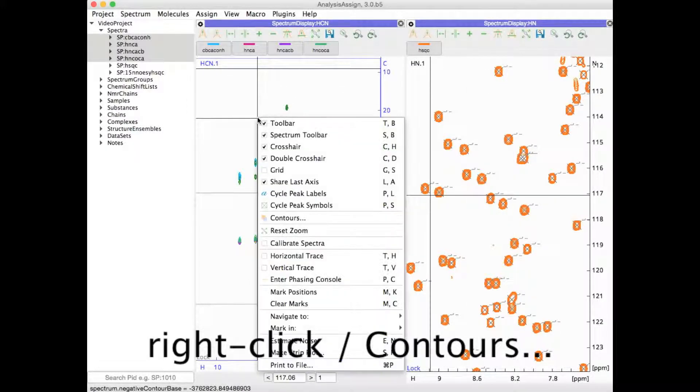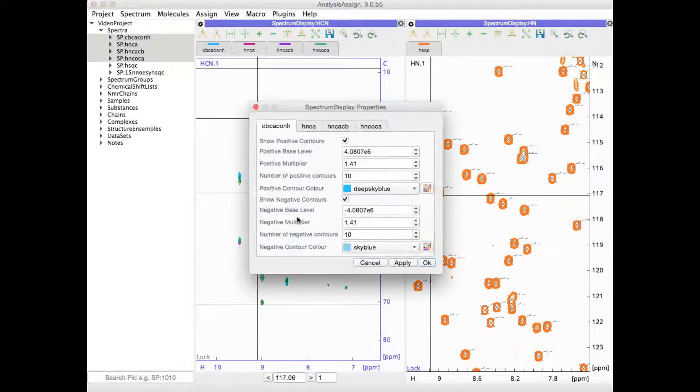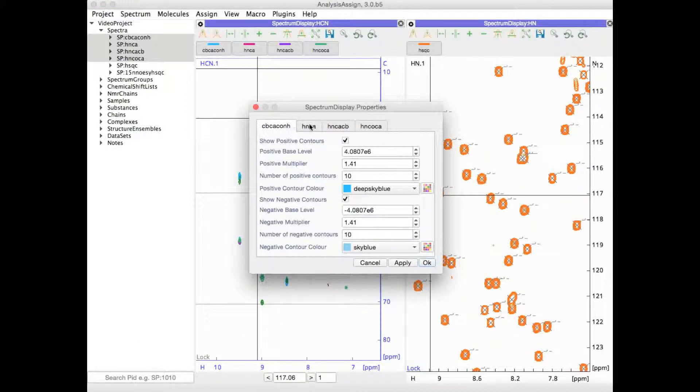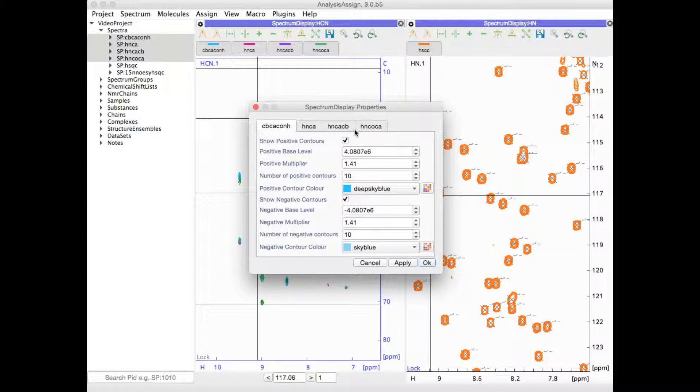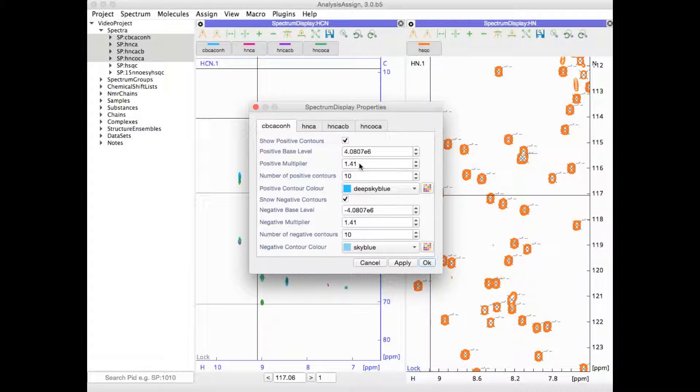You can also right click and go to Contours. For each spectrum that's visible in that display separately, you can set the contour base level, the multiplier which essentially determines how close together the contour lines are drawn, the number of contours and the color.